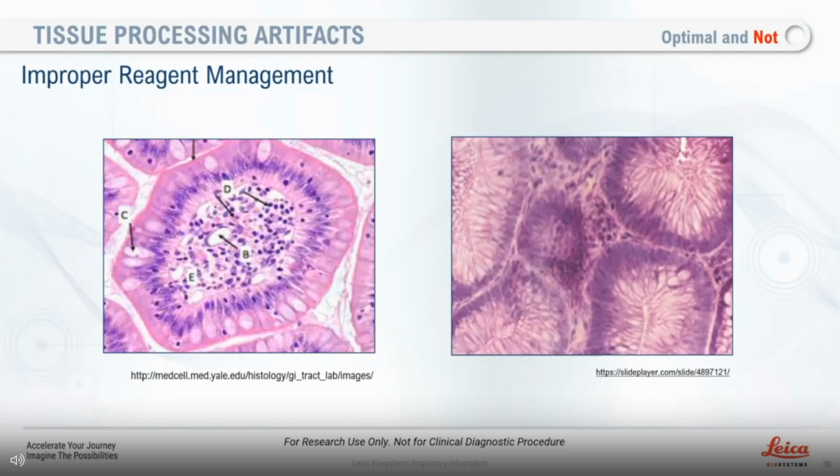It's common to see pressure and vacuum on some processors. I have seen runs that don't have anything on them until they get to paraffin. So it's about what works for you and your laboratory and your tissue. Every lab I have found in the last 12 years with Leica is unique and does things a little bit different in the way they process and the way they establish protocols. But if it's validated and it's working all the way down even to your advanced staining, then that's great. Great. Thank you.